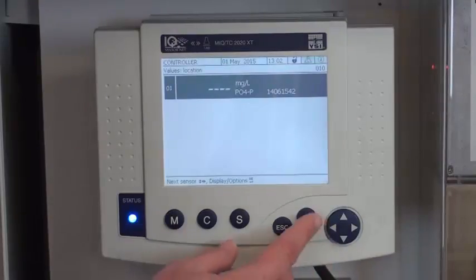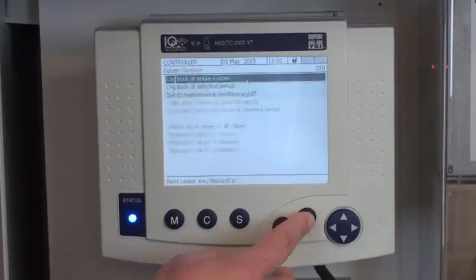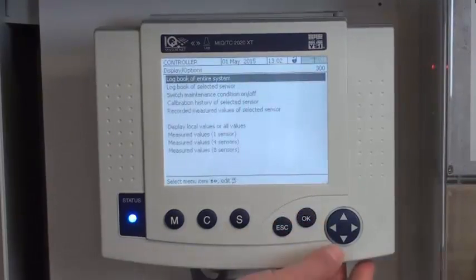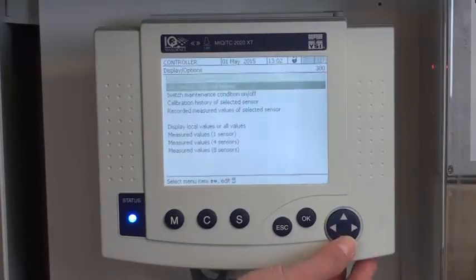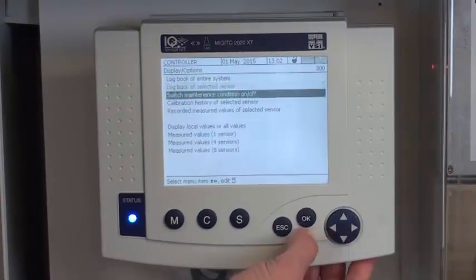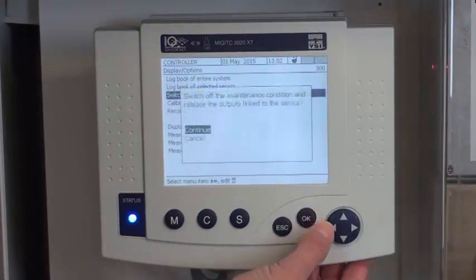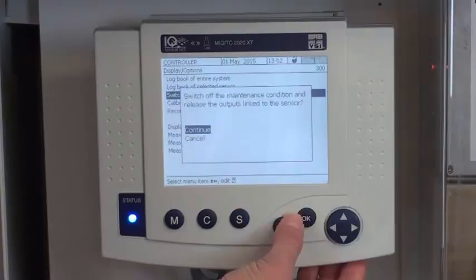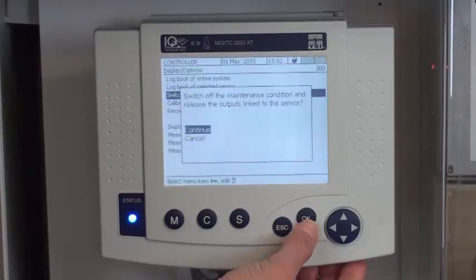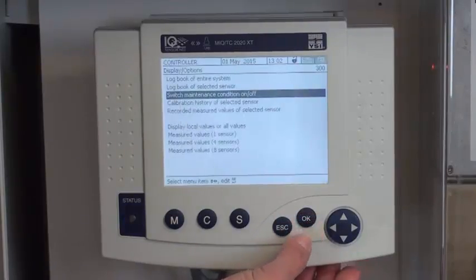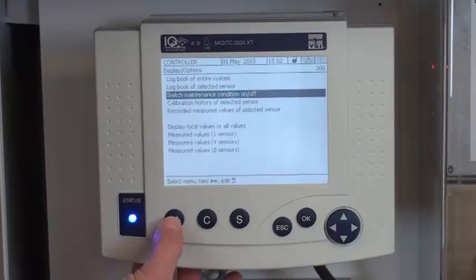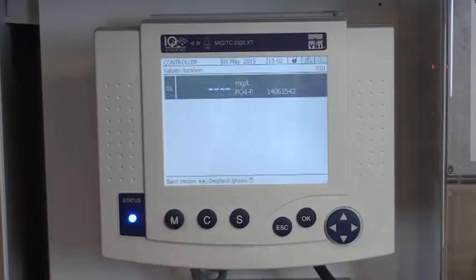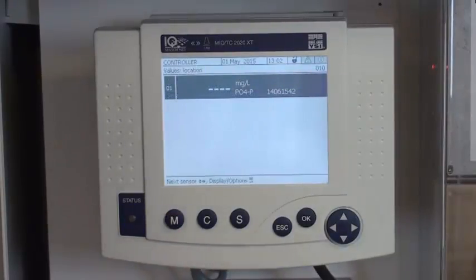Since we just did startup, don't forget to go back in and turn maintenance condition off. And then press M to go back to the measurement screen.